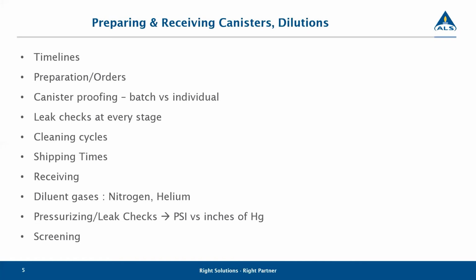As far as the cleaning cycles for the thermal desorption tubes, and I'll mention that here, we will talk about it a little bit later, but the cleaning cycles for the thermal desorption tubes are a little bit different. The thermal desorption tubes are stripped. So when they go onto the instrument, they're thermally stripped. The thermal desorption GCMS literally heat strips the sorbent material inside and takes that and concentrates that onto a trap, and then that's analyzed.